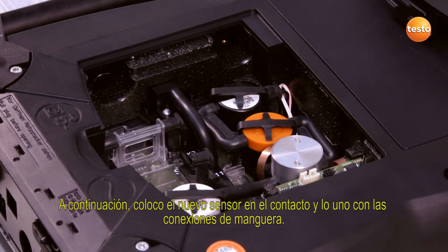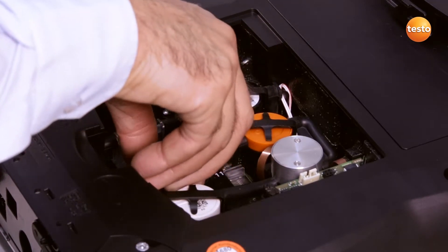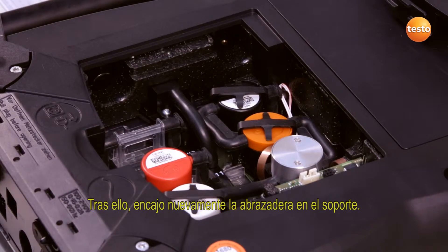I then insert the new sensor into the slot and connect the sensor to the hoses. After this, I click the clip back into place.